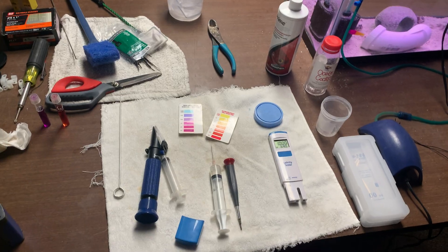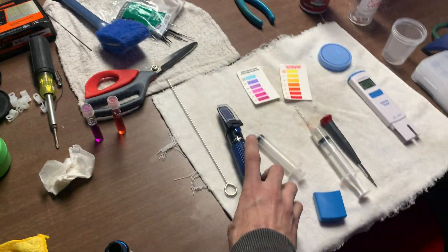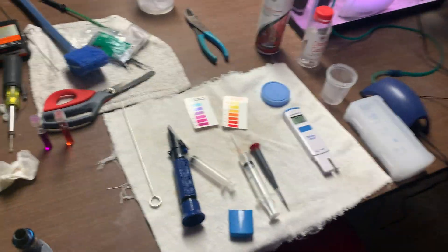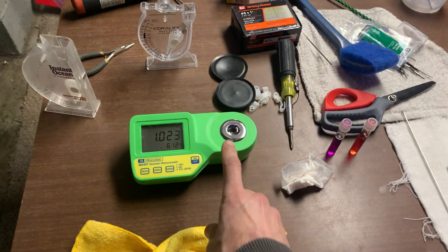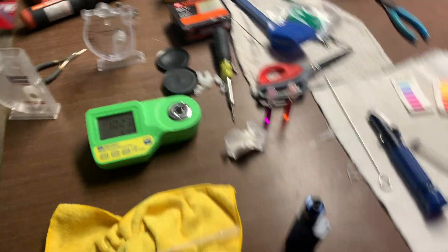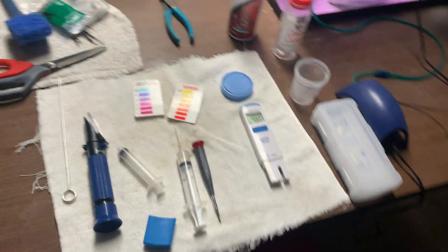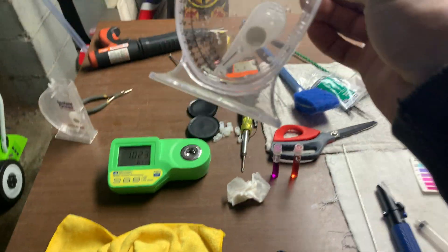So I ended up buying this, and I ordered the calibration fluid for it, which now I have. So this is calibrated, and so far, this one here I think is correct. It does have some fluctuation though. This new hydrometer seems to be spot on accurate with this, and I trust it.